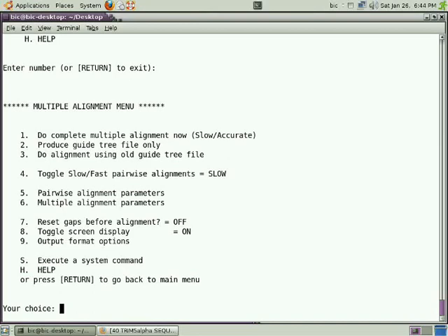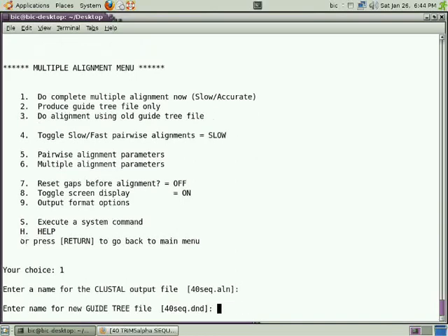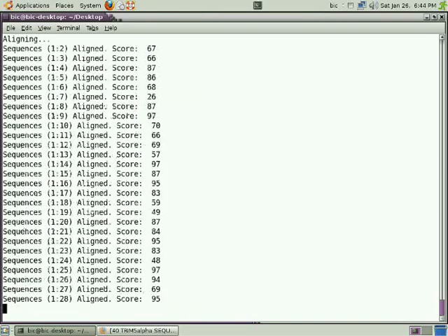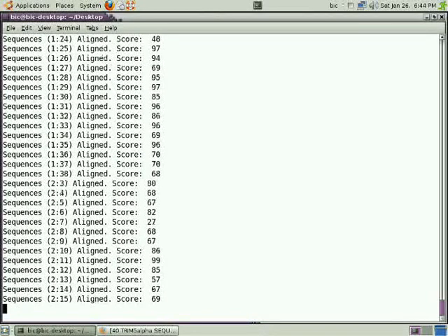You can go to do multiple sequence alignment by pressing choice 1. If you want to change your output file name, you can type your file name; if not, leave it to default. Similarly for the DND file also. Now let the program run.